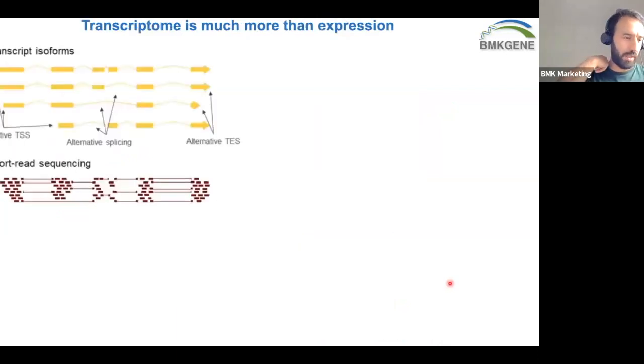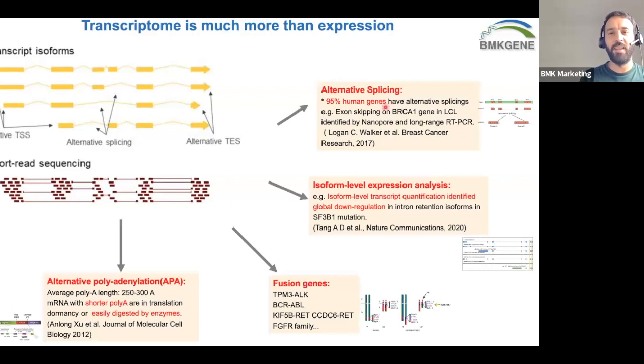If we talk a little bit about isoforms, you know that proteins can have different isoforms like alpha, beta, gamma. This is related to different mRNAs. The mRNA is coming from one gene, but because of alternative splicing, the mRNAs differ in size. If you want to identify different isoforms using NGS, sometimes it's difficult. It's not always easy to do that, but it's not the only thing.